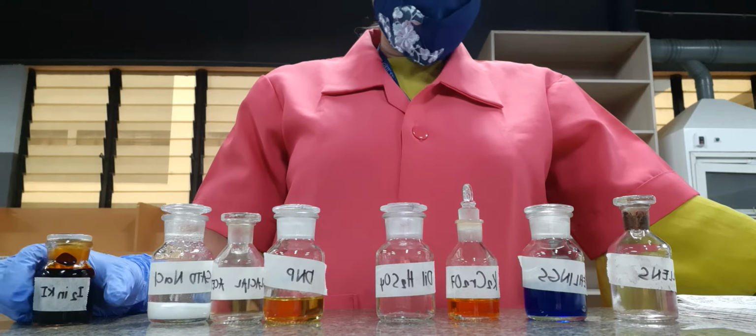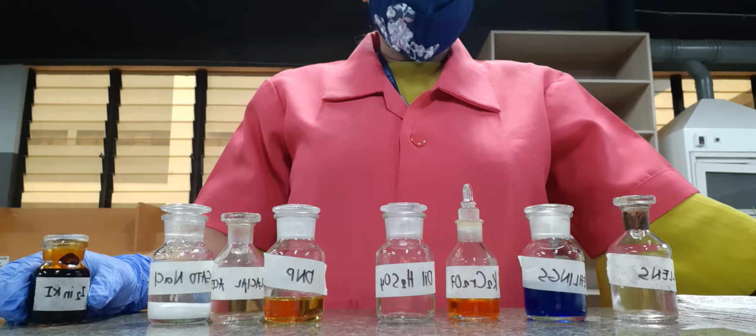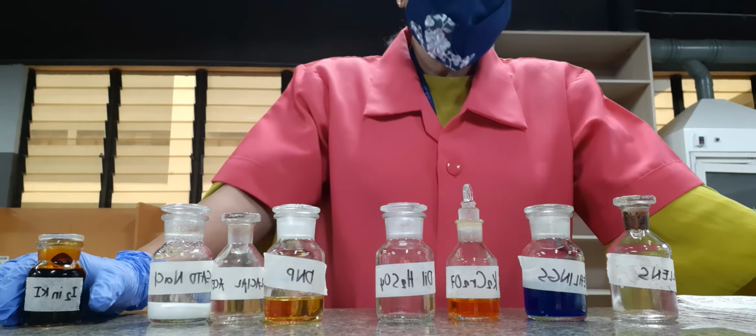So with DNP, we expect that a bright yellow or orange precipitate will be observed. Our last oxidation reaction would be the iodoform test. Iodoform here is only intended for acetaldehyde and methyl ketones, just like your acetone. So once again, the iodoform test can only be used for the detection of acetaldehyde and methyl ketones, such as acetone.